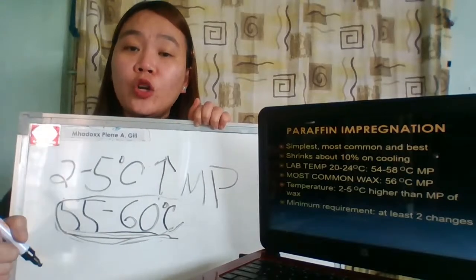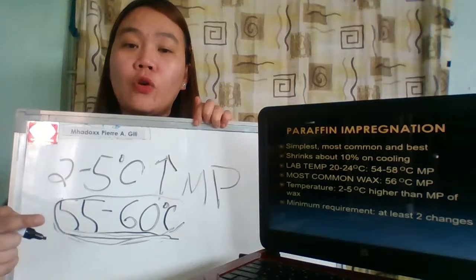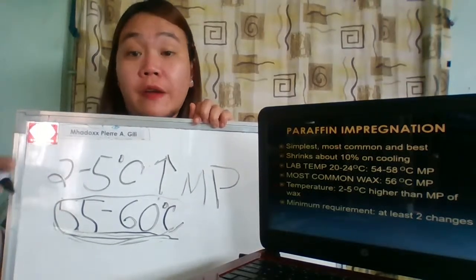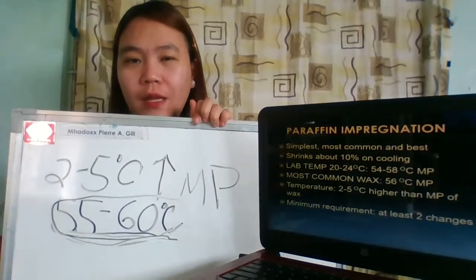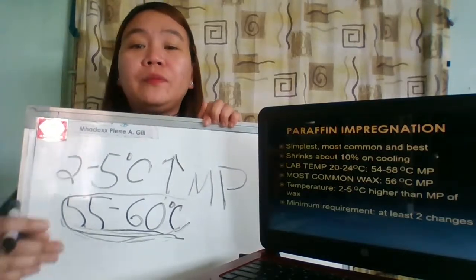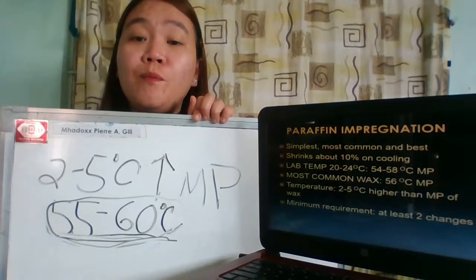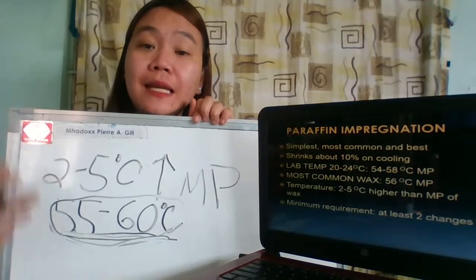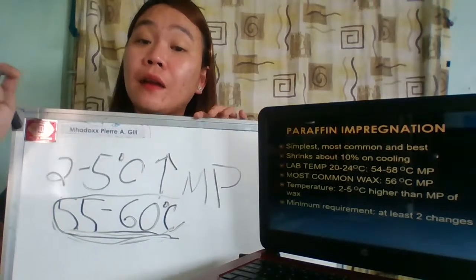Why? Because if you are going to perform impregnation beyond, more than 60 degrees Celsius, it will be deleterious.